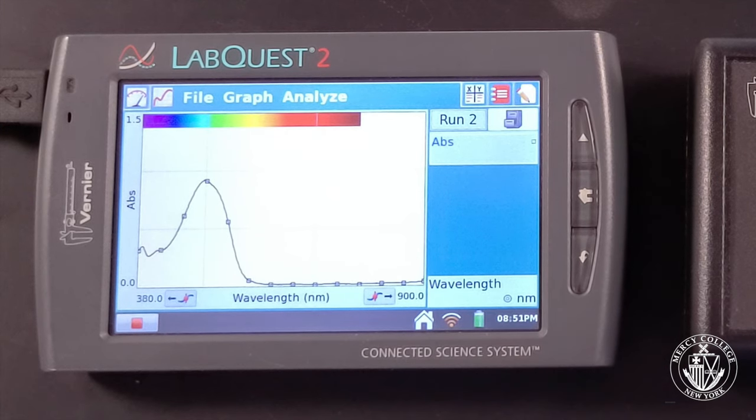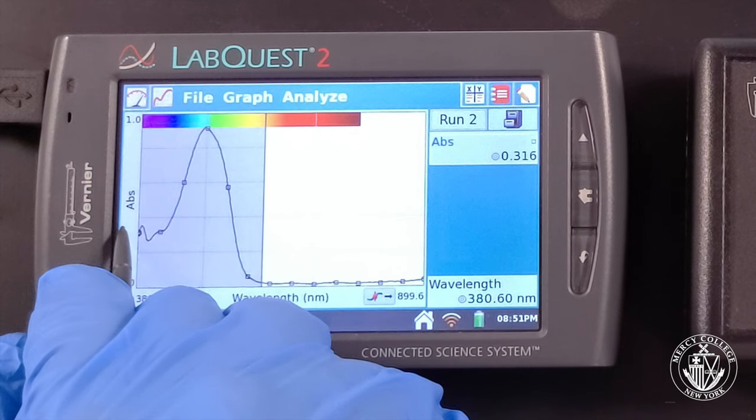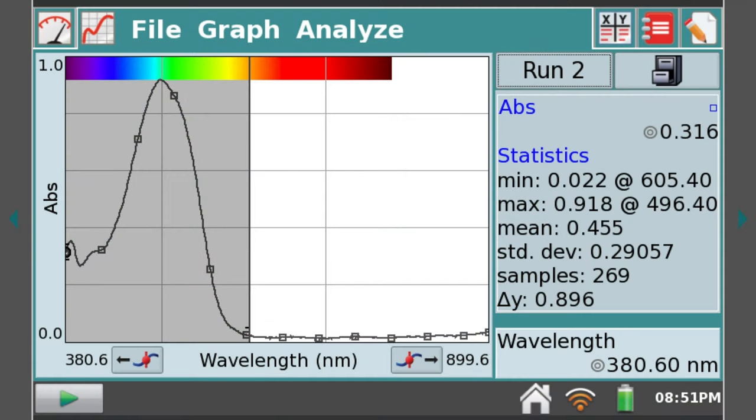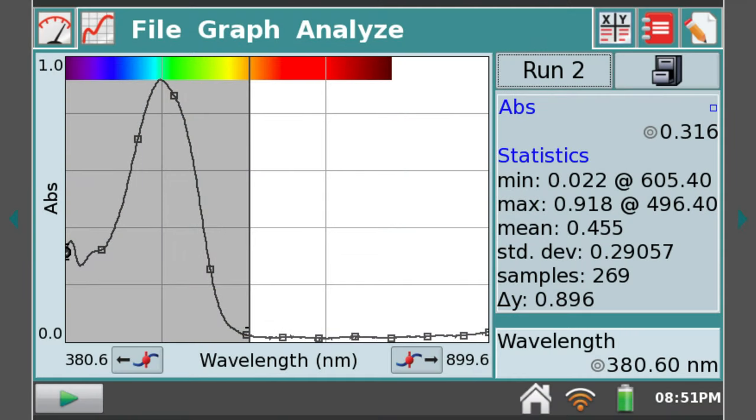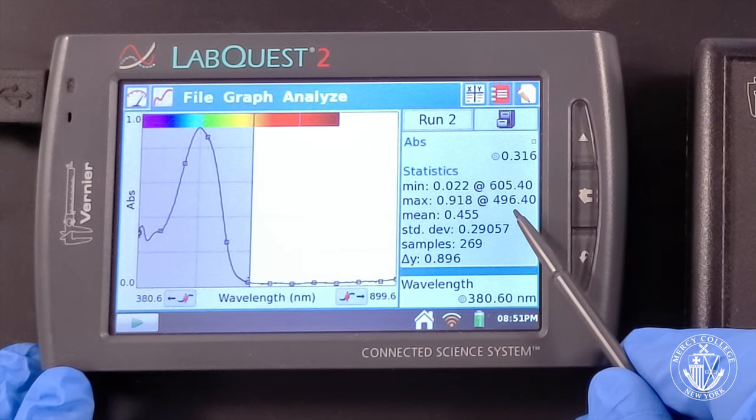Stop the data collection when you have obtained a stable spectrum. Again determine your peak position and maximum absorbance by selecting Statistics from the Analyze menu. Here we see that this dye also absorbs in the blue-green region of the spectrum, with a maximum absorbance of 0.918 at a wavelength of 496.4 nanometers.